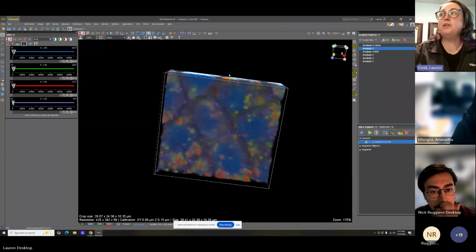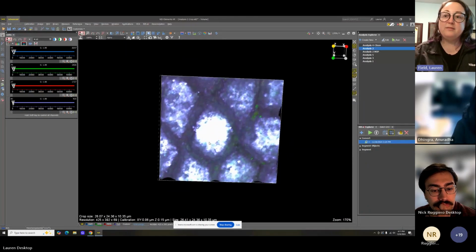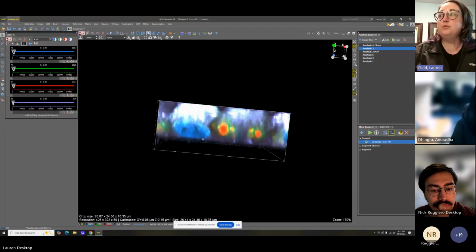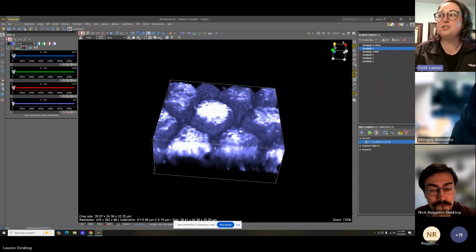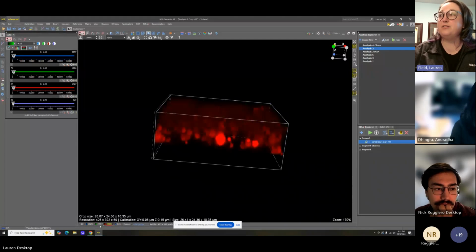When I first started playing with this, I thought I would use this purple value as the parent, and then decided that the nucleus actually worked pretty well for what things were doing. You lose purple really quickly in this, where all of your red are. I didn't think a single layer would be useful for that kind of parent-child relationship, but your DAPI are right on the same level as a lot of your green and red.